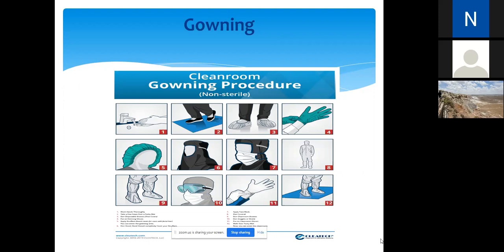If you're bringing in your laptop, it has to be wiped down with isopropyl alcohol before it can go in the clean room. You cannot bring in your regular paper or notebooks. You have to use clean room paper inside the clean room. You cannot use mechanical pencils or pencils.